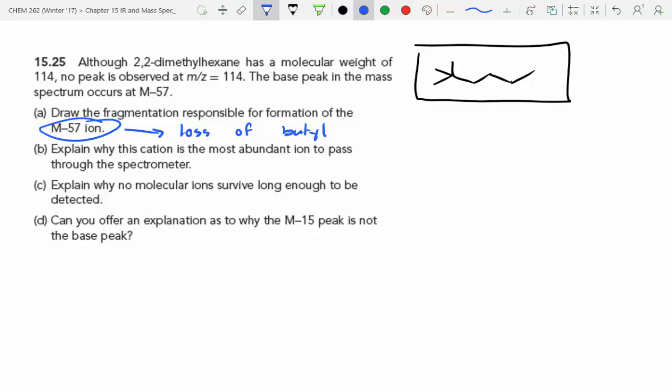Okay, so are you trying to tell me that we are losing this butyl fragment? That is not what you're saying. Do you care to clarify, Marcus? The tert-butyl group, right? So there's a bunch of butyls. The tert-butyl fragment, we know if this pops off, it's a nice stable carbocation. So like I said, sometimes your parent ion isn't even detected because you can form a really stable carbocation. So in this case, what we're likely observing is this radical cation combo.